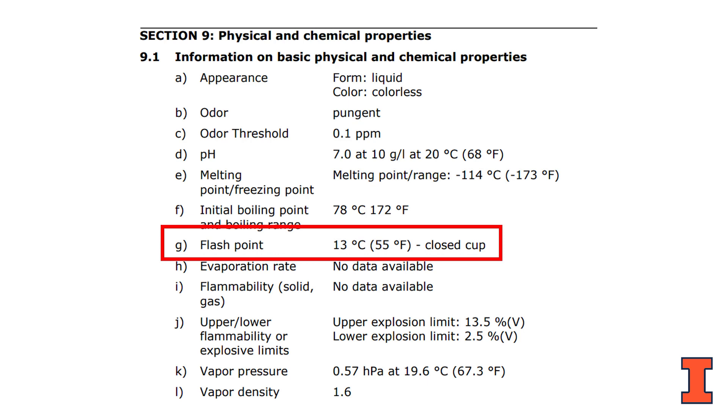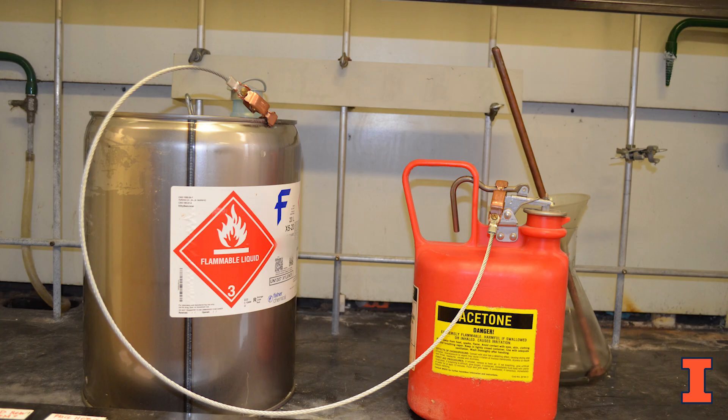The flash point of solvents can be found on Section 9 of the Safety Data Sheets. Bonding is the process of electrically connecting the dispensing and receiving container so that they are at equal electrical potential and will not have static spark discharge.